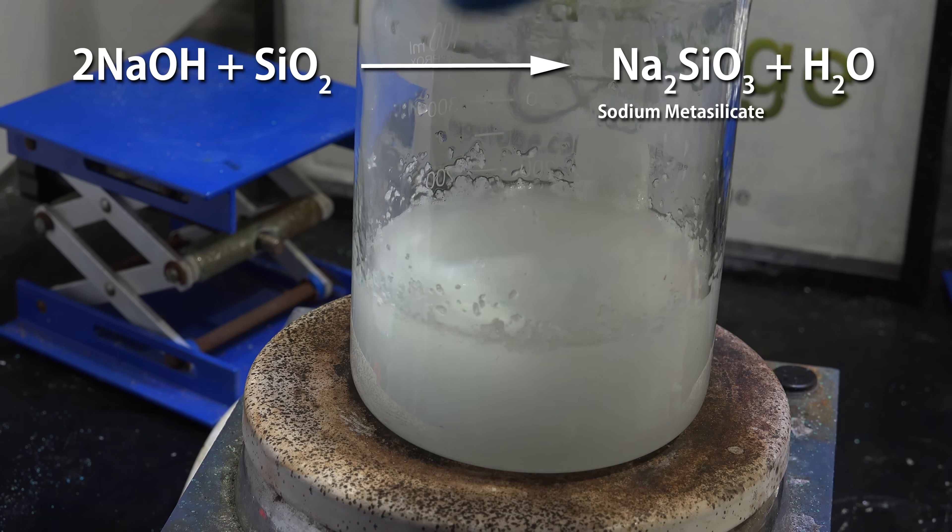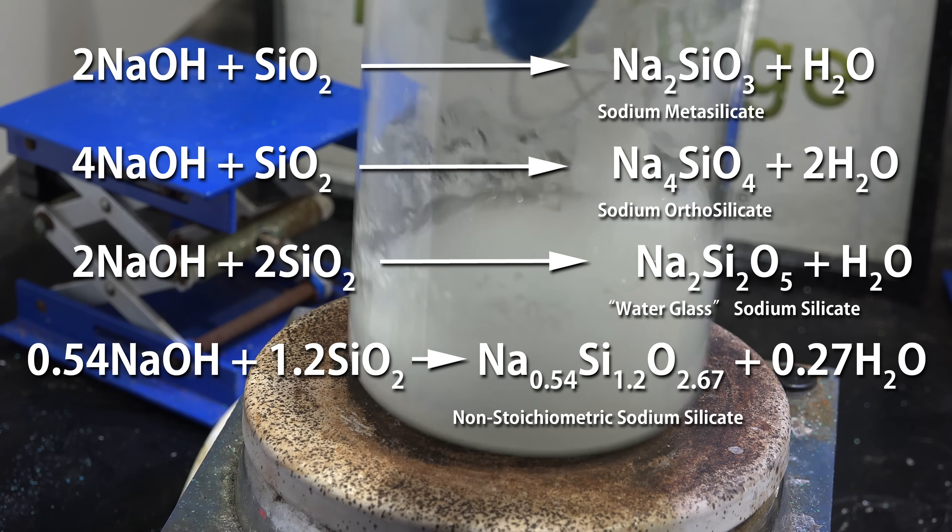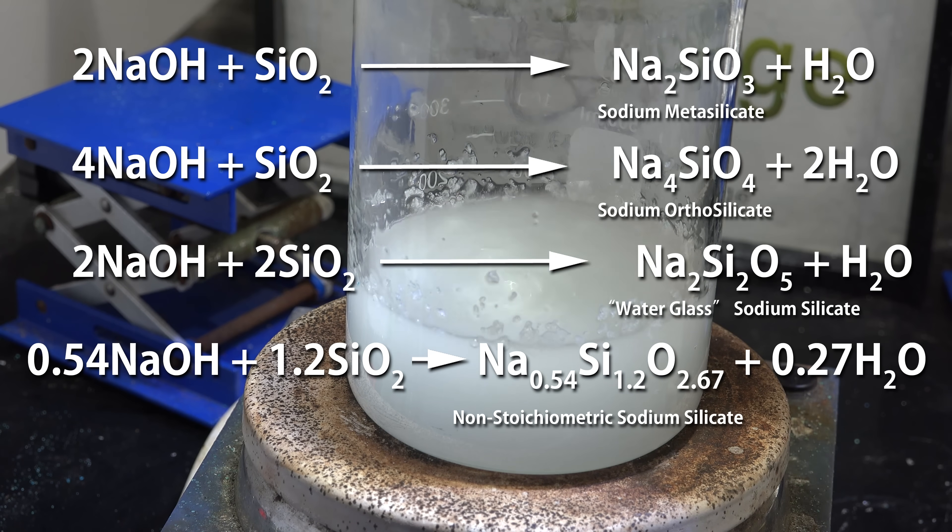But sodium silicates are not strictly defined as this ratio. Sodium silicate actually covers a broad range of ratios, and you can use four moles of sodium hydroxide to make sodium orthosilicate. Alternatively, you can have sodium-rich formulations and even non-stoichiometric ones.